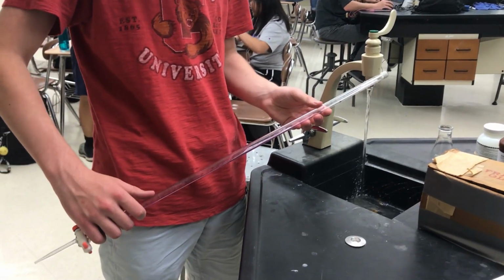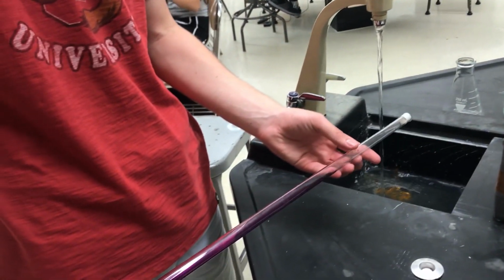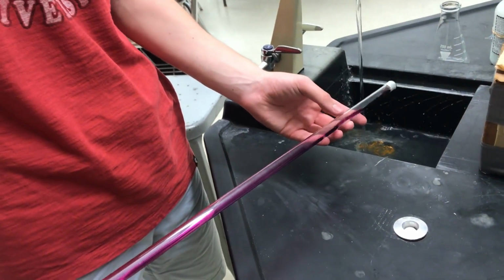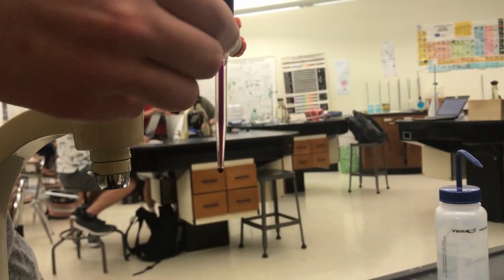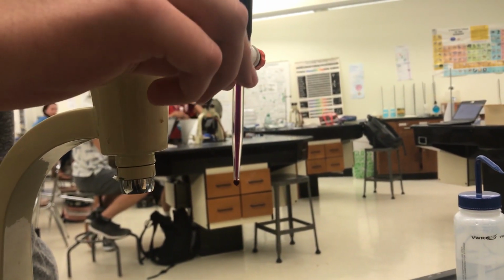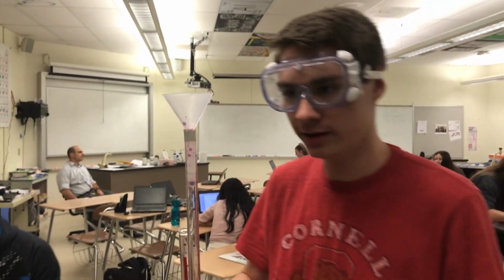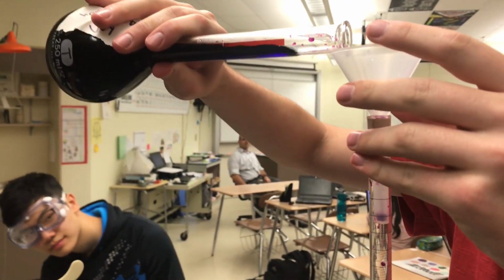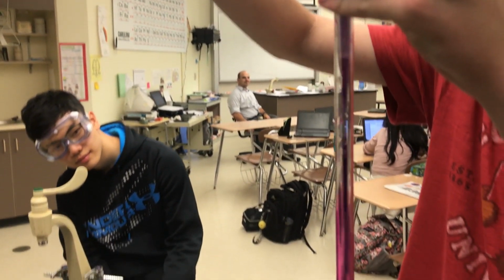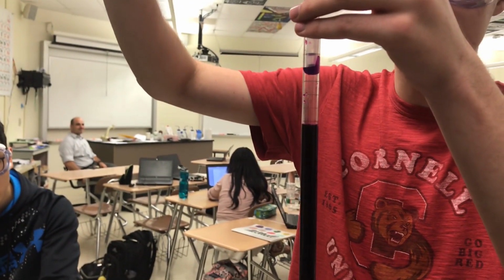If you're ever putting any of your solution down the sink, make sure it goes down the drain with plenty of water. Once you have the interior filled, make sure the tip is completely filled and primed before you do the titration. Now we can fill our burette up to the top with our stock solution. Make sure you do not cross the top line.